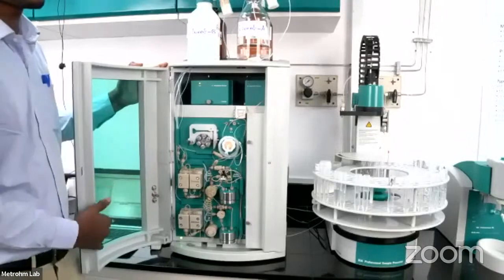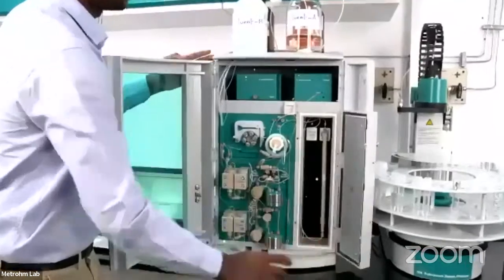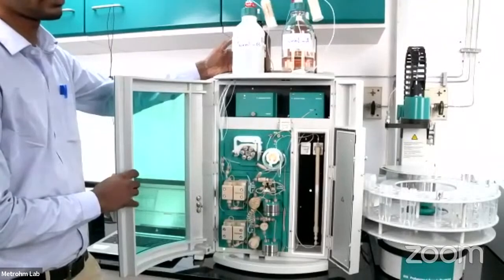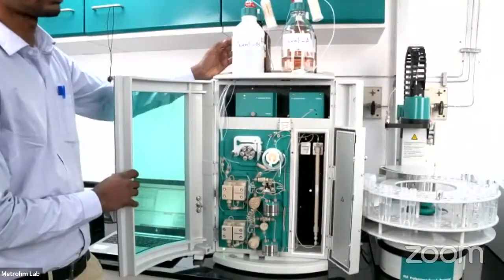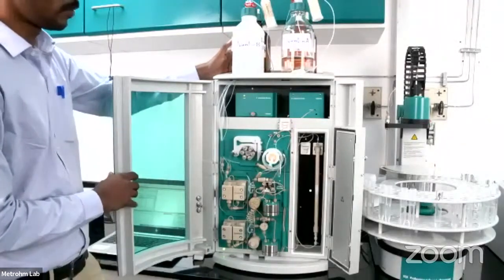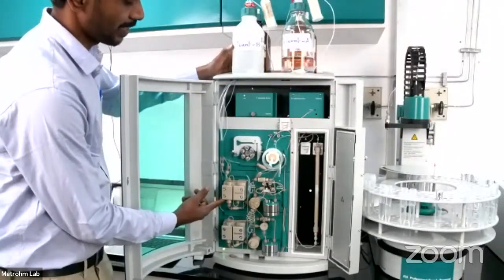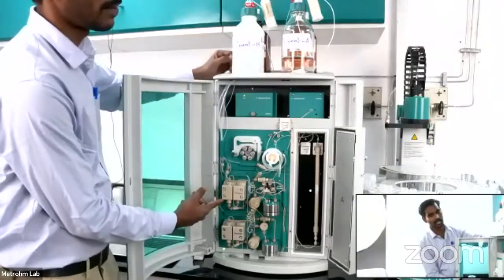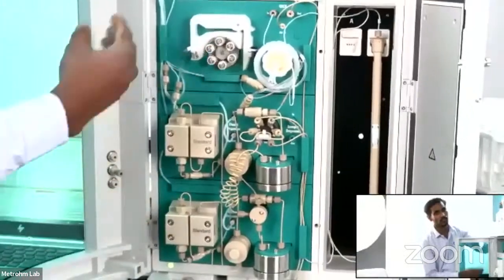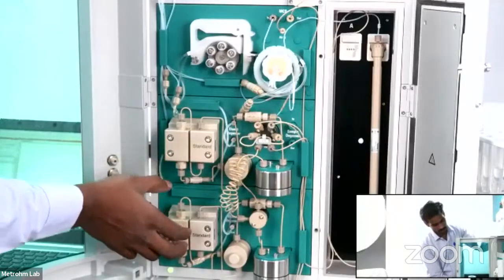You can see all the components are in twos. So for example, this is the eluent, its starting point. In our presentation, Rajnish showed our chromatography flow path. So it starts with the eluent. After the eluent, it's connected to the high pressure pump. Here only the eluent is connected, and the eluent comes through gravity. Once it reaches the pump, the pump will carry the eluent throughout the system. This is the main job of this pump. After this pump, it's connected to the purge valve.